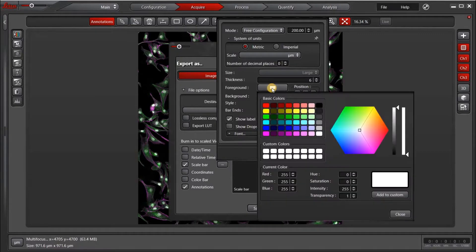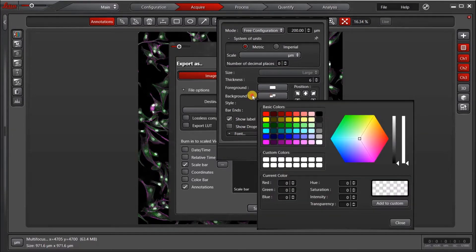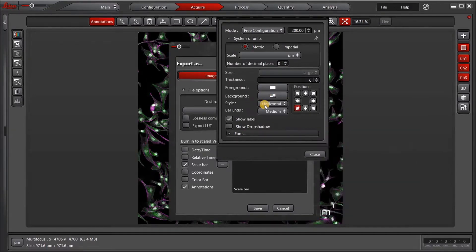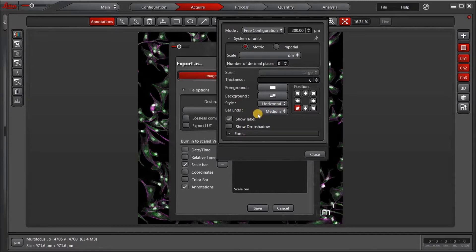I can choose the foreground color, the background color, or make it transparent. I can make a horizontal or vertical or a crosshair scale bar. And I can also choose what size of the bar ends I want to make.